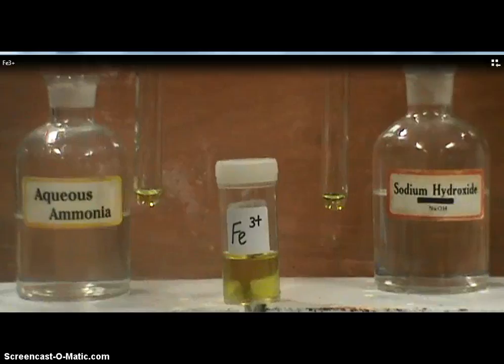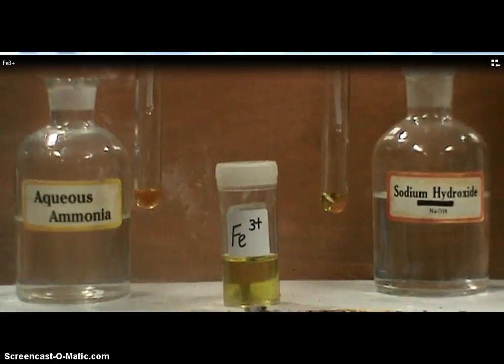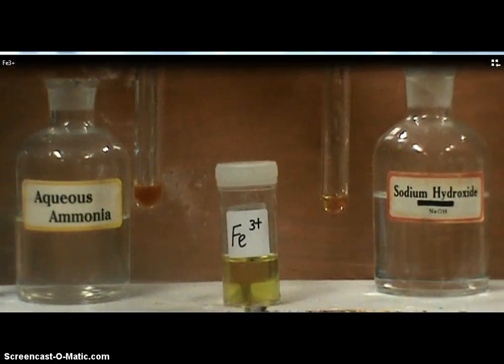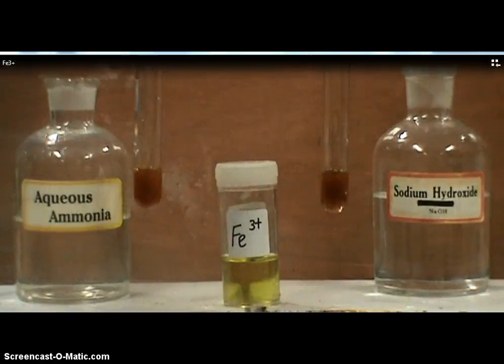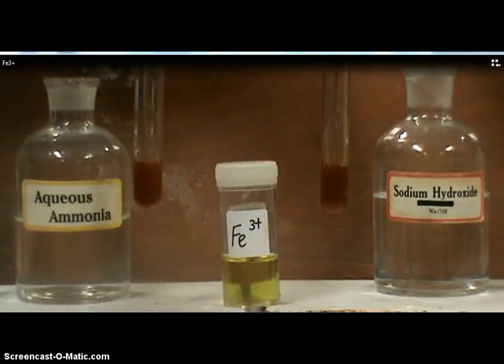Finally, with the iron 3+. When a few drops of the alkalines are added to solutions containing the iron 3 ions, a reddish-brown precipitate is formed. The reddish-brown precipitate is insoluble in excess of both alkalines.